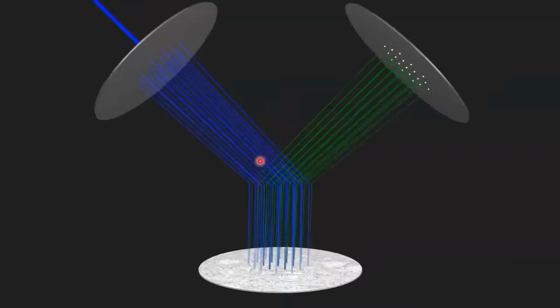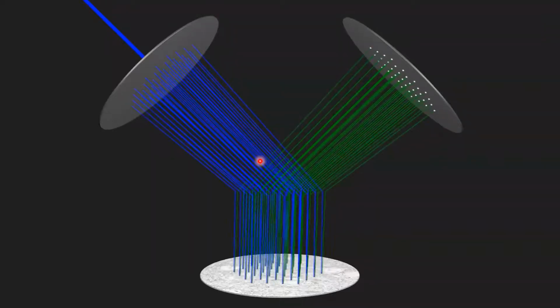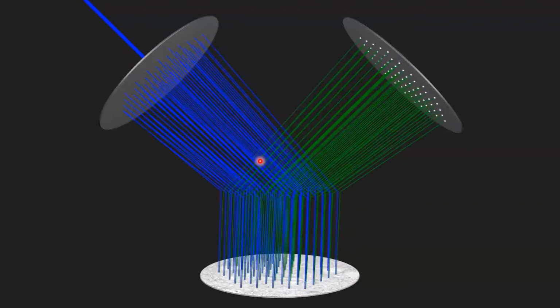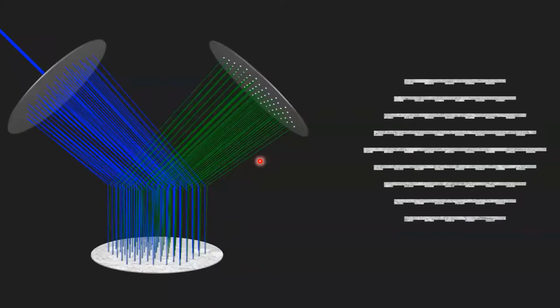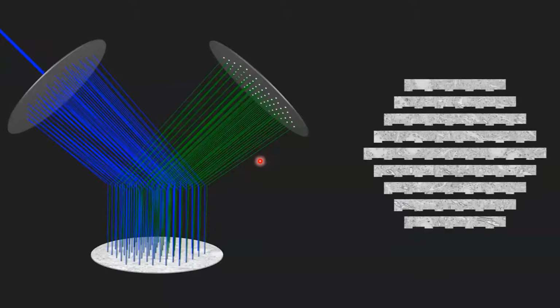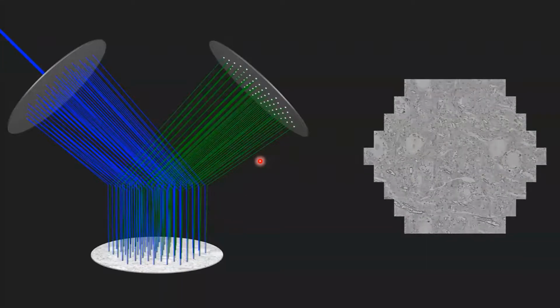That right away allows you to understand that each of those beamlets scanning over the surface creates an image in parallel. We can increase the number of beamlets now to 61 beams, or there's a second machine that has 91 beams, and that right away gives you the increase in throughput that you can easily calculate. But it's not only that, we applied some more tricks to not only scan in parallel, but also way faster.